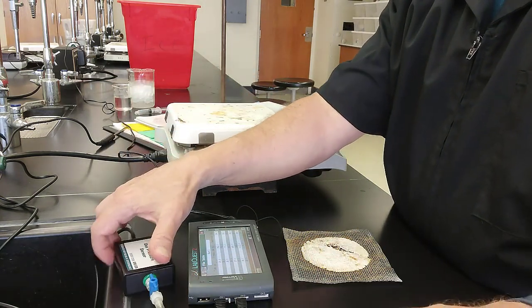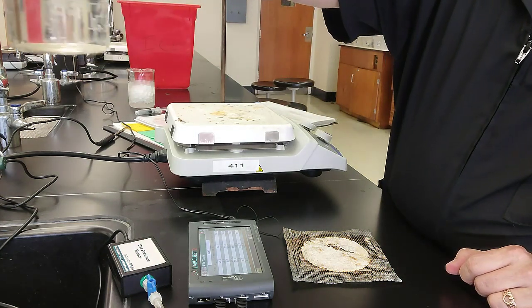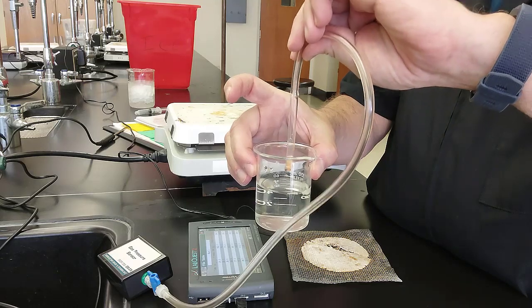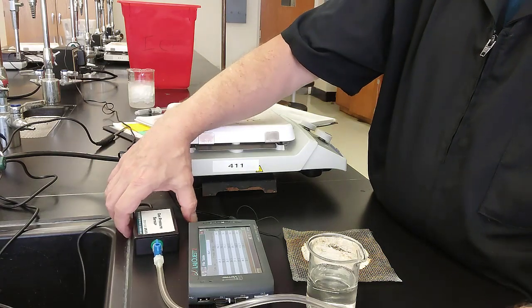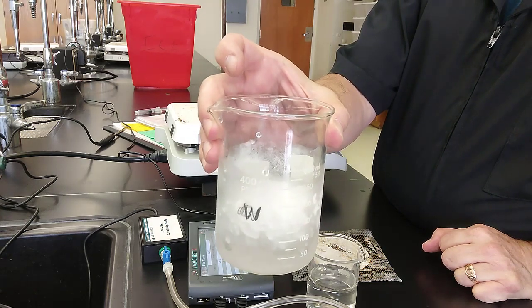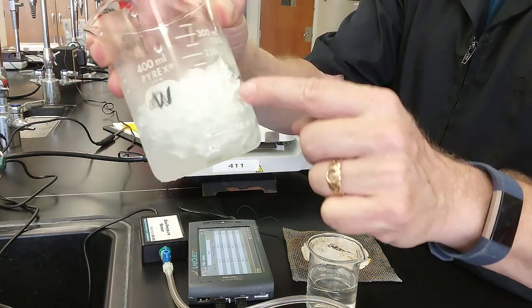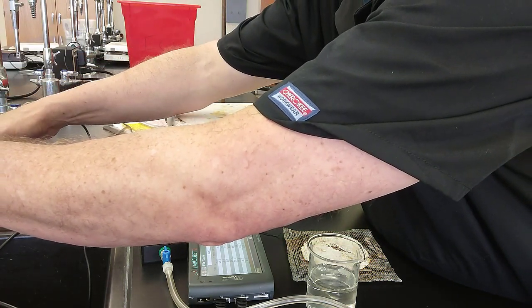So what I'm going to do is slightly change the procedure. I have a 100 milliliter beaker with around 60 milliliters of water in it. And I'm going to submerge my dropper into it. I am also going to then change the temperature by putting it in ice and putting it on a hot plate. Now an ice bath is not just ice in a beaker, okay, because we're not going to get enough surface area contact with the ice cubes. So you need some water to make a true ice bath.